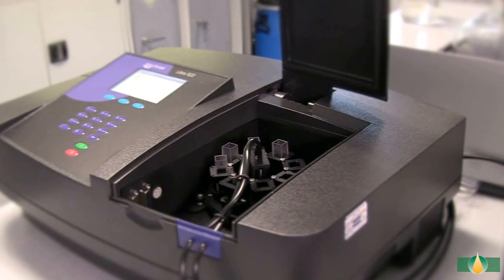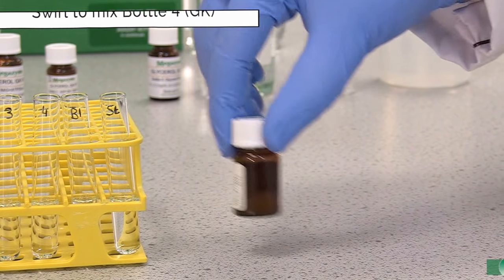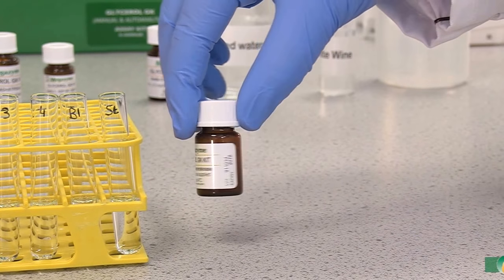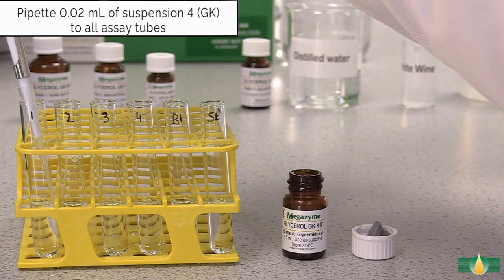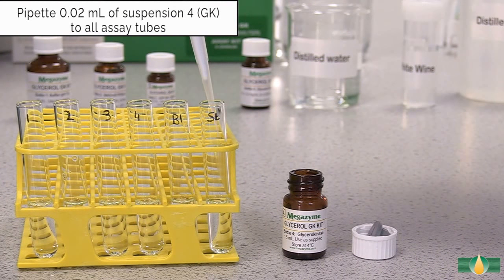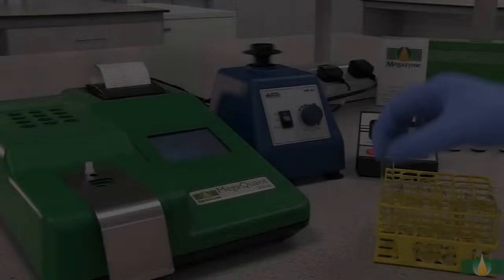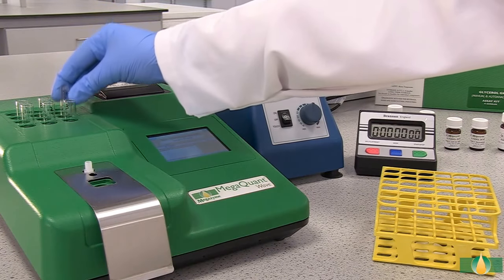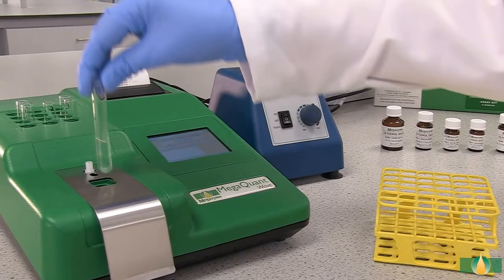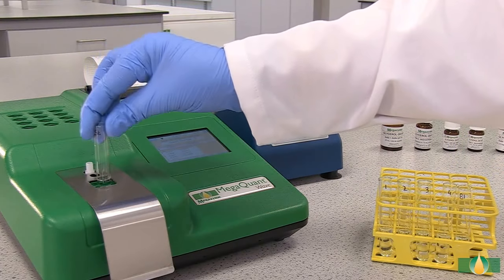Alternatively, a recording spectrophotometer with 1 cm path length cuvettes can be used. Swirl to mix the contents of bottle 4 prior to dispensing. After recording the A1 absorbance value, pipette 20 microlitres of the trigger enzyme glycerokinase into all assay tubes. Mix the tubes thoroughly and incubate them at 37 degrees Celsius for 7 minutes to allow the reaction to go to completion. Record the absorbance reading A2 for all of the assay tubes. This absorbance reading completes the measurement of glycerol.